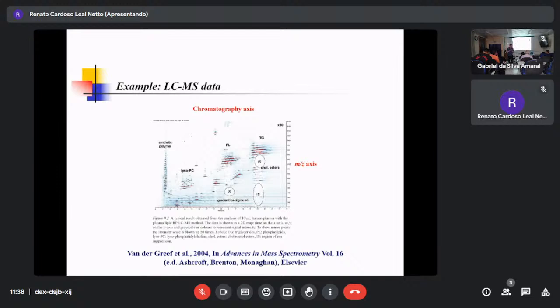But with NMR, no. It's only one name. Young is enough, not Young Choi. So if you use two names, it means the data size is much bigger. Right? So how much is it? More or less I can explain to you.